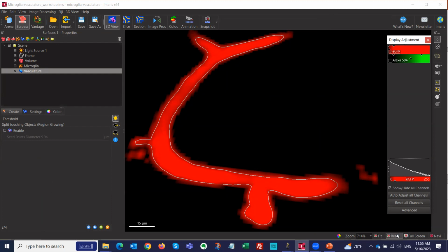Sometimes you have a specific shape, like if the rounder they are, or they look like a star, you want to keep those. Then you paint them as foreground, and the ones that are the same brightness but don't look like a star, you tell the software it's background and it will do this. It's also a good way to fill holes. For example, if you have a vessel where the outside is really bright and the inside is hollow, you can tell the software that all of this is your foreground, even inside, to fill the whole vessel with volume. Then you get the segmentation of the whole thing rather than just the outside of the vessel.